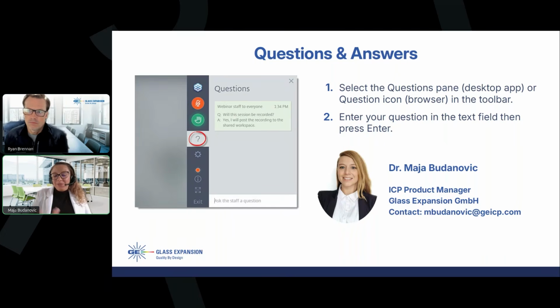That's kind of a visual check. But of course, with any nebulization, if it's not ideal, if it's not optimal, you will see it in your results. So it can be higher RSDs or changes in your sensitivity. And sometimes the size of the droplets that I was talking about, you might not be able to see very well just by visually observing, but you can see it in your results.